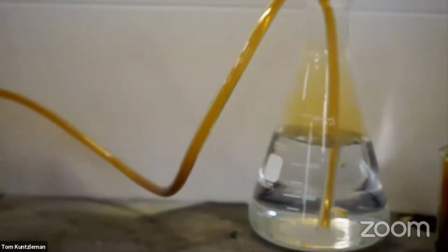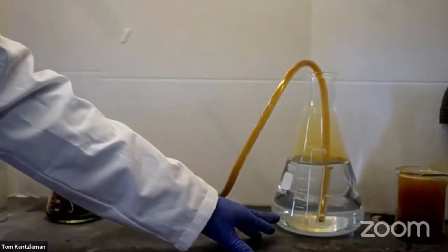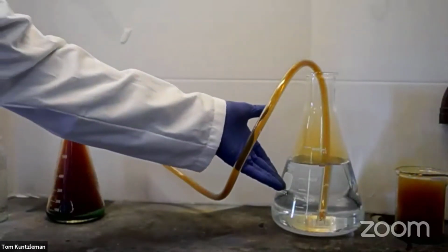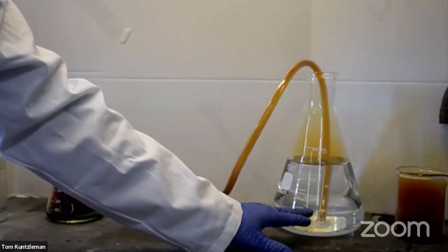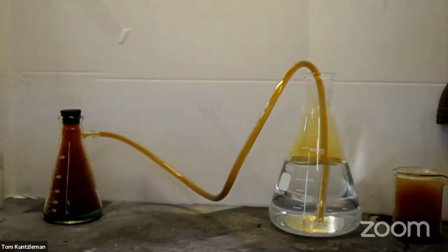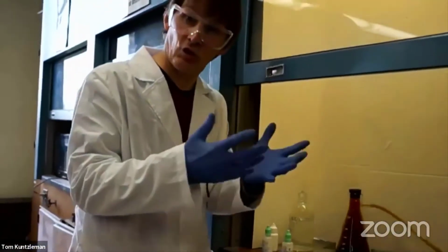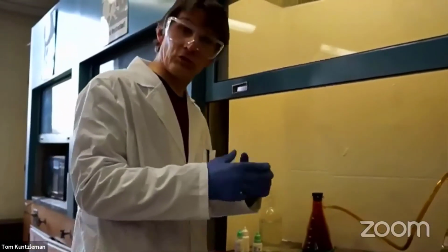Well, remember, I told you that this indicator that I added is blue in a base, which I added, and it's colorless in an acid. So what happened with this particular gas, when it bubbled through this water, it made the water acidic. And we can tell that because the color went from blue to colorless. Isn't that interesting? And this happens with a lot of gases. Carbon dioxide is another one. When certain gases dissolve into water, they form acids. And nitrogen dioxide happens to be another one of those gases that, when it dissolves in water, forms an acid.